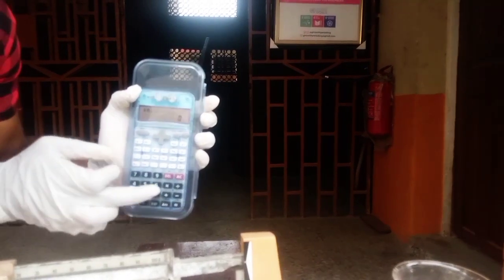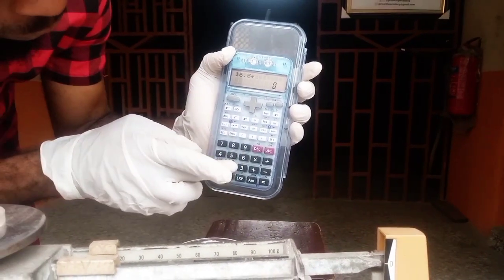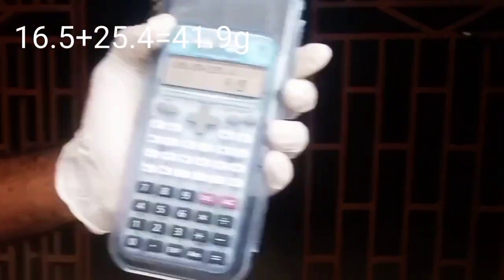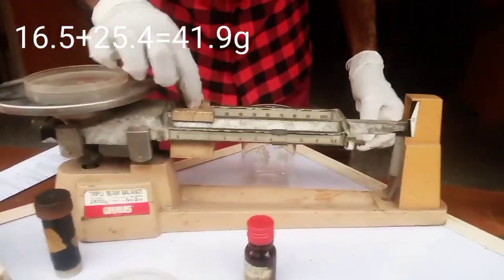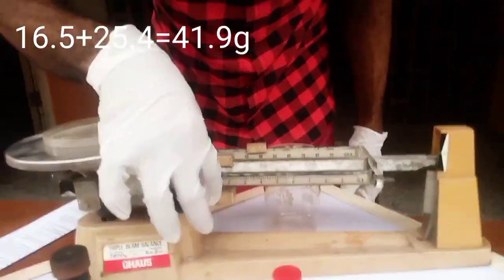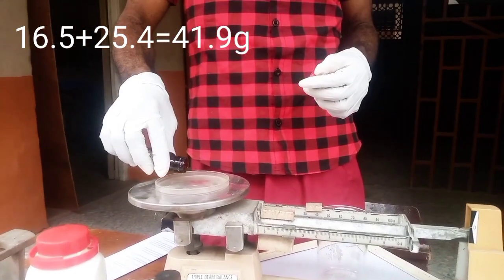Okay, we have here 16.5 gram, and we need to add it to the 25.4 gram of the iodine so that we are going to balance it at that point. The value is 41.9. So I bring up my iodine after I've pushed this to 40 and 1.9. Therefore 40 plus 1.9 will give us that 41.9.